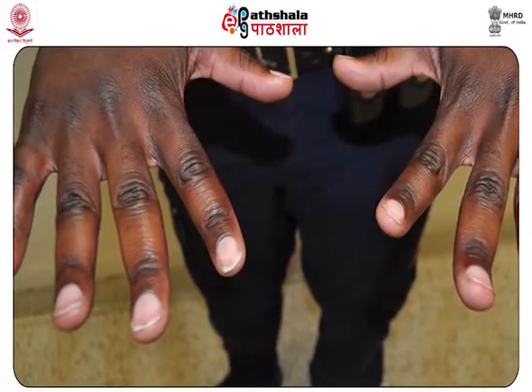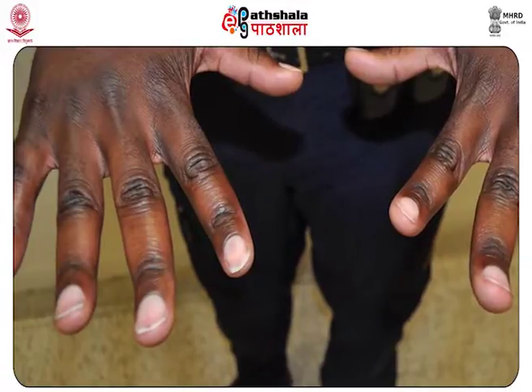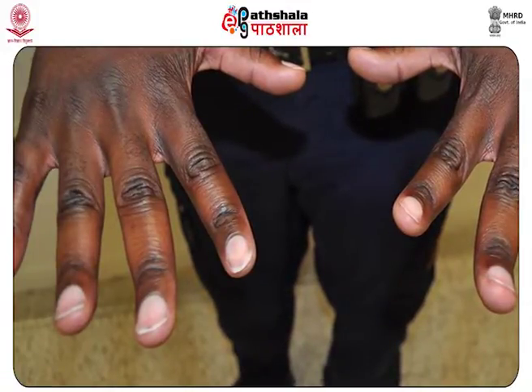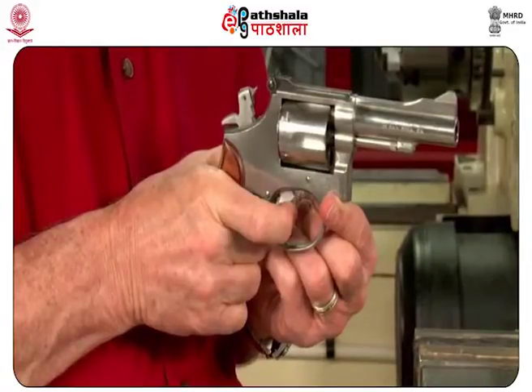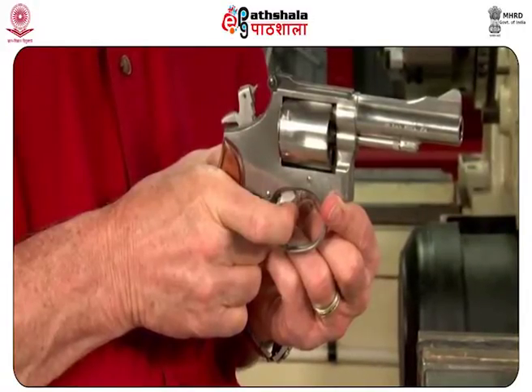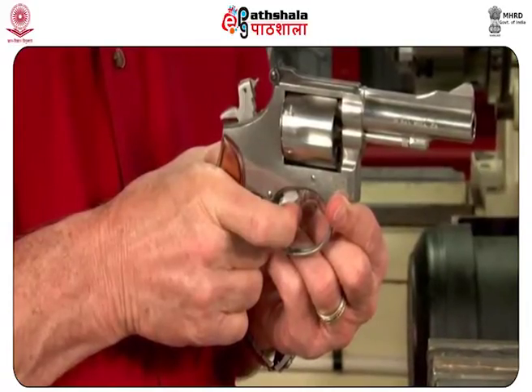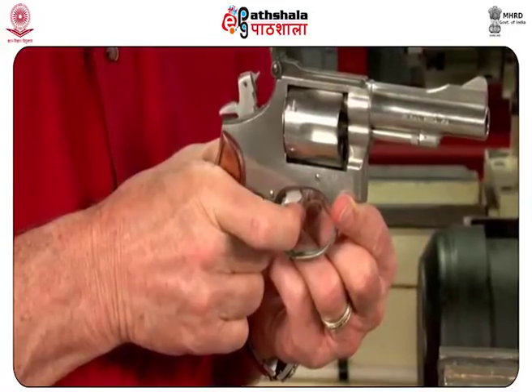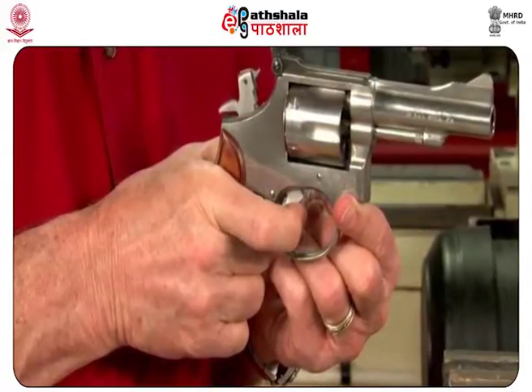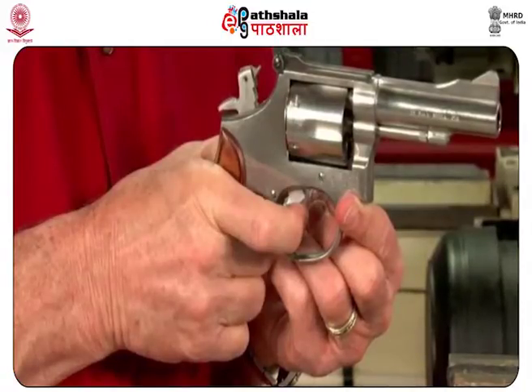In cases of suicide, GSR particles can be found on the body of the shooter as well as on his clothes. GSR particles may be found in the barrel and chamber of the weapon as well as on the outside of the barrel. These GSR particles may be found in the air. Presence of GSR particles has even been reported in the excreta of the shooter.